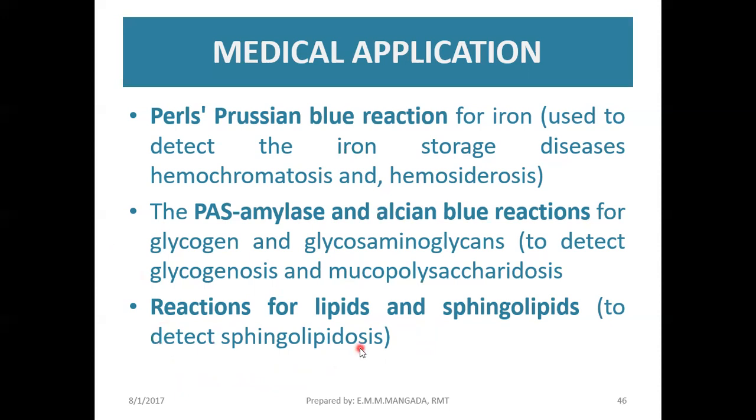Like for example, bakit may ganitong accumulation nitong substance na to? Kasi yung enzyme na to has a missing activity. So the enzyme is lacking, kaya itong precursor substance na to, hindi siya nakakonvert sa substance na to kasi wala yung enzyme na nagko-convert sa kanila. Hindi natin ma-detect yung kanyang activity using enzyme histochemistry.